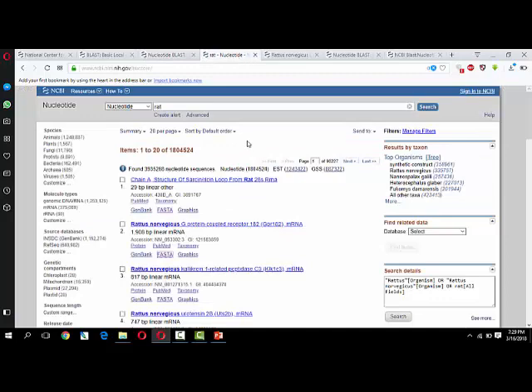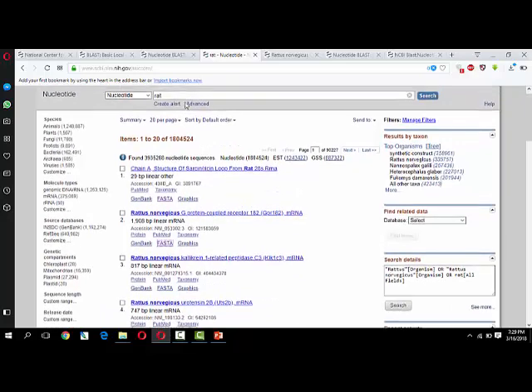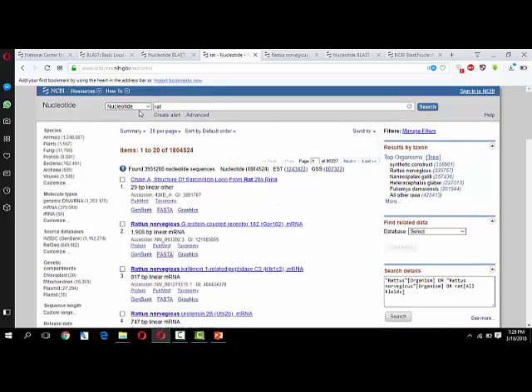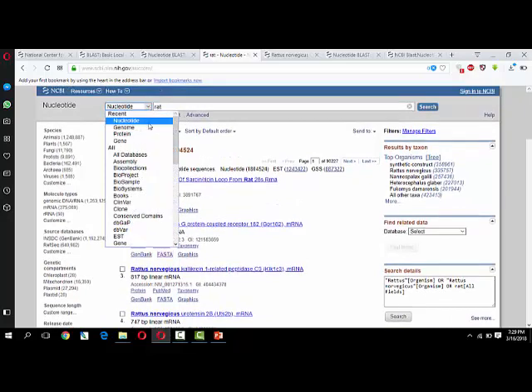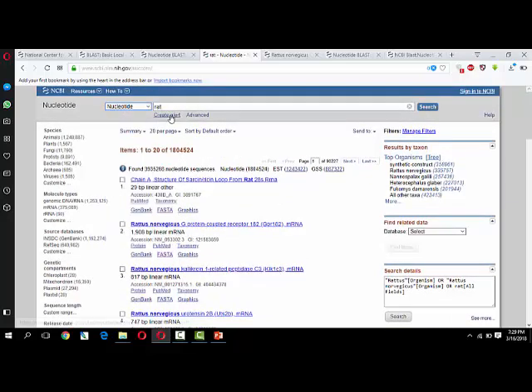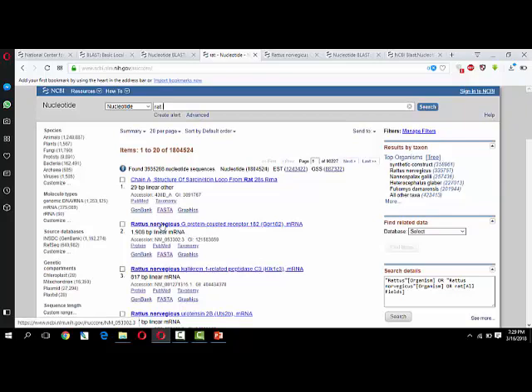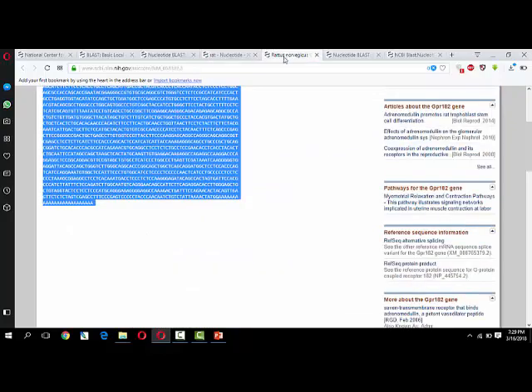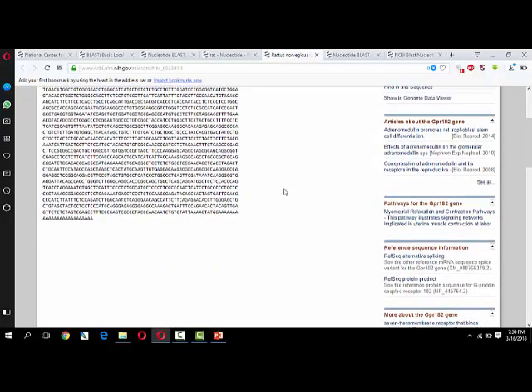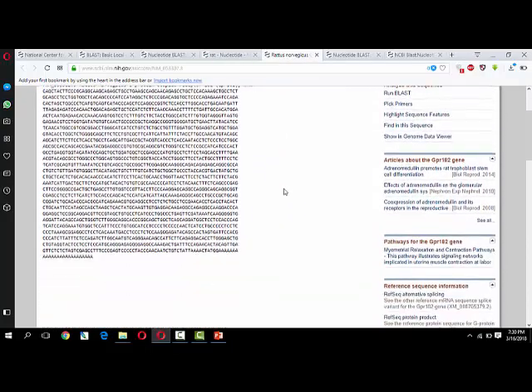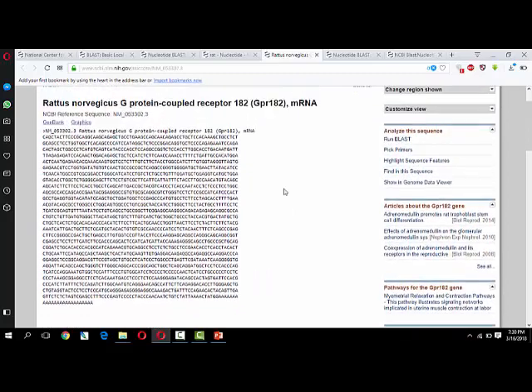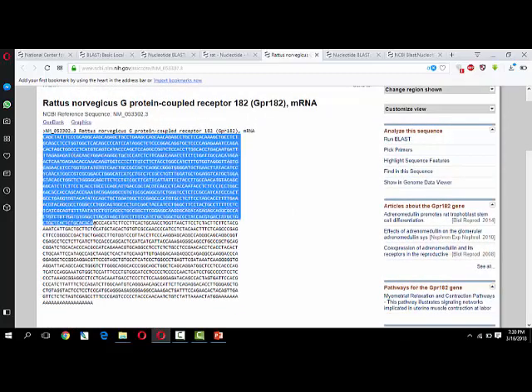Now you have to find a sequence of nucleotides. I have selected nucleotide from here and wrote 'rat.' When I clicked on this sequence - Rattus norvegicus G protein-coupled receptor 182 - I found this nucleotide sequence. It is in the FASTA format of ATGC.